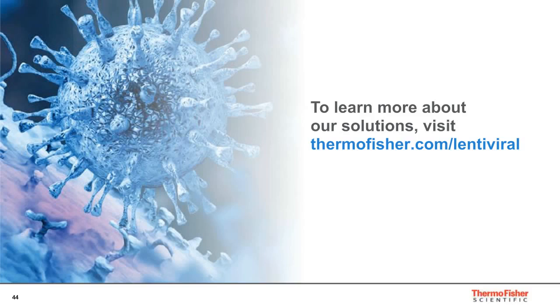Okay, and Sheen, this next one is for you. What primary factors influence viral titer yield? Yes, I'll answer this question. Besides the size of the gene of interest encoded in the transfer plasmid, which affects the viral yield, many other factors can influence titer as well. If we are only focused on lentiviral production, the most important factor is establishing a good suspension cell culture. Always follow the suggested cell density to split the cells and grow the cells. Never let the cells overgrow or split them at a low density.